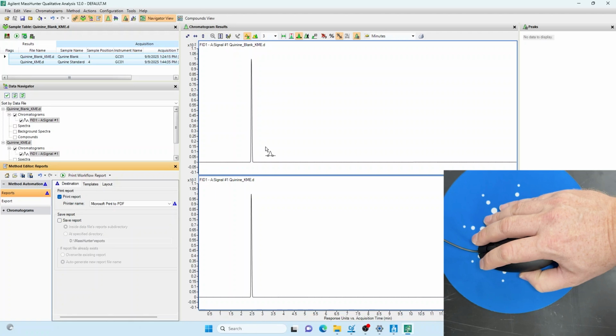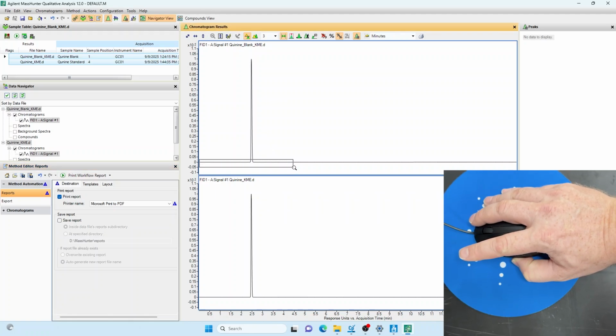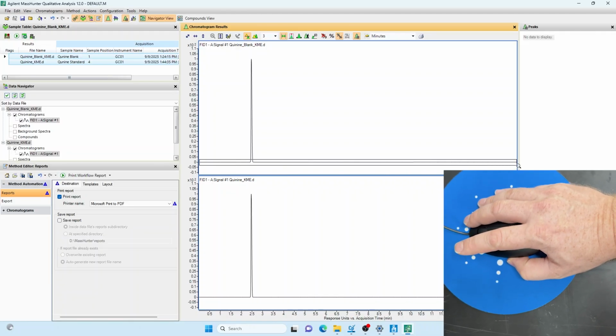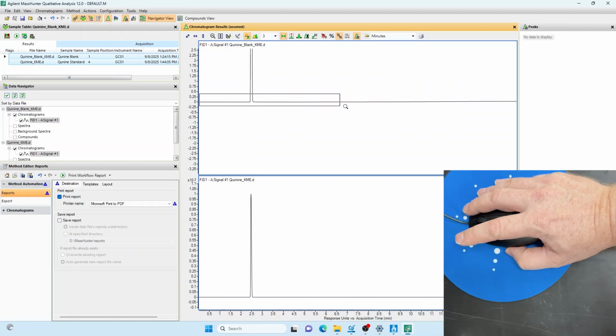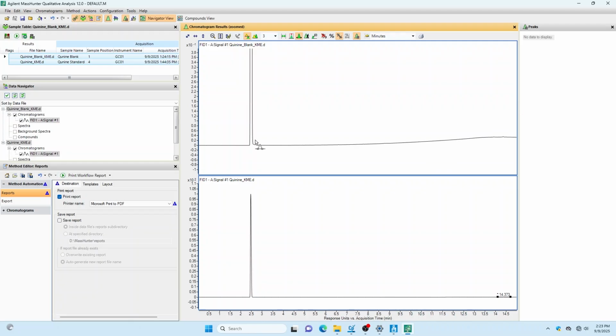The way that you drag in this software is you click and drag, but you click and drag with your right. It's a right click. It's an alt click. I'm sort of exaggerating that here by lifting up my left finger. So you right click and drag along the baseline. We're zooming, we're zooming, we're zooming. You will always have to zoom with GCFID. You should never just turn in what shows up on the data. It will be very wrong because it's zoomed so far out.